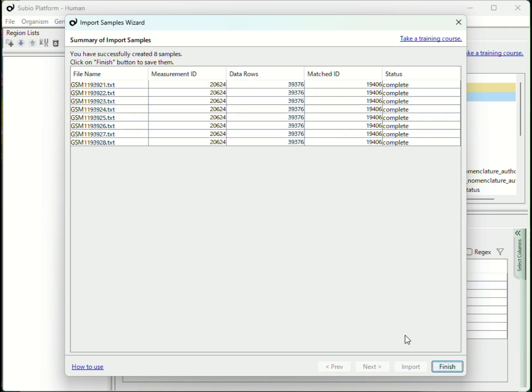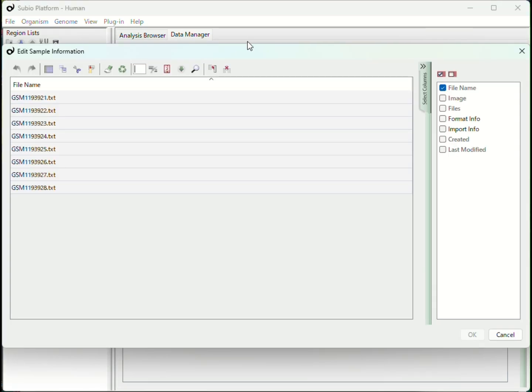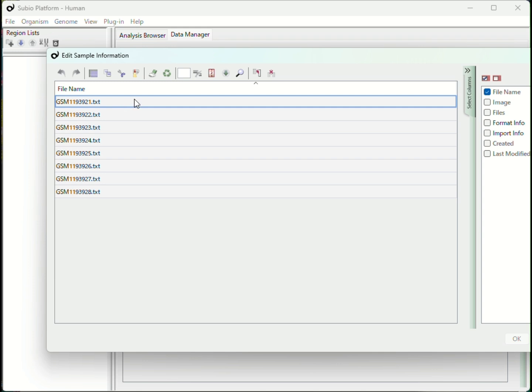You may notice that the number of rows is reduced compared to the original file. At this stage, non-coding RNAs have been filtered out. Since GEO sample IDs are not very informative, import metadata from the soft family file.